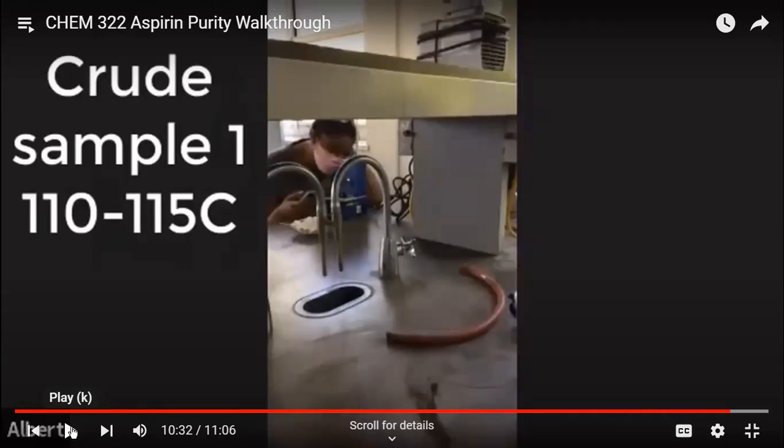All right, and that's all samples. Sample 1, sample 2, or sample 3. You can put in for the crude 110 to 115 degrees Celsius. About 20 degrees off the expected melt temperature. Yeah, and you expect that to be off, right? Because the crude is dirty and has a bunch of other stuff in it. And so if the melting point of the pure stuff is 135, you don't expect the crude to have the same melting point unless the reaction went to about 90% completion. You expect it to be off on purpose, right? Because it has impurities, and those impurities affect the physical properties.